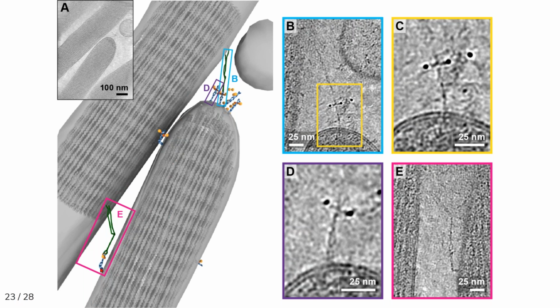And quite strikingly, in that example too, the protocadherin 15 had this 90-degree bend between cadherin domains 9 and 10, which for me makes it very possible that this bending motion does have a real physiological importance, and that it's important for protocadherin 15 to adopt the geometries that are required during the trafficking of the tip link to the tip of the stereocilium.